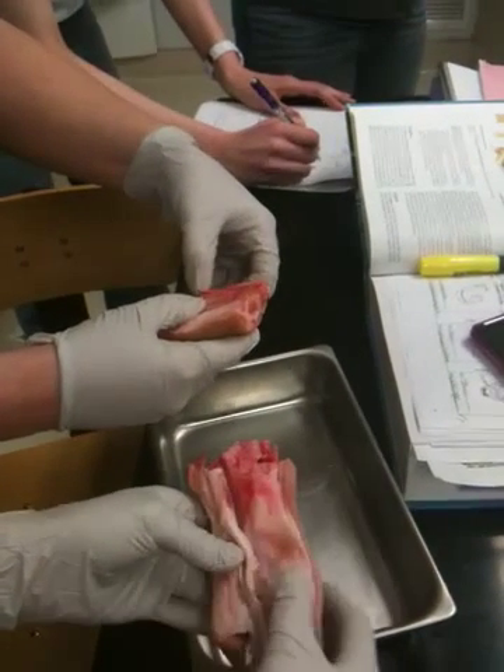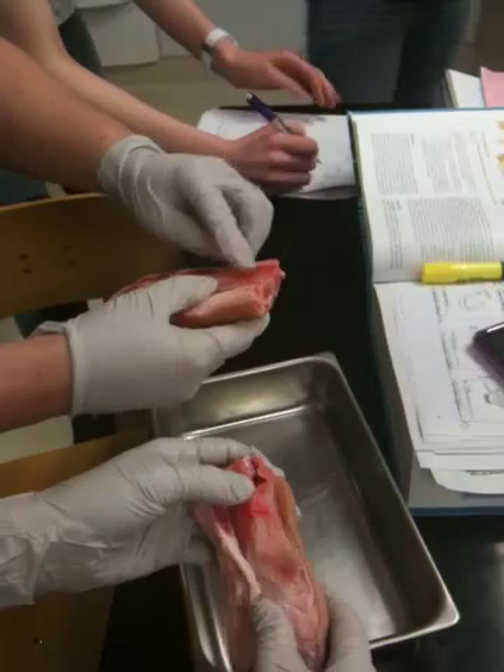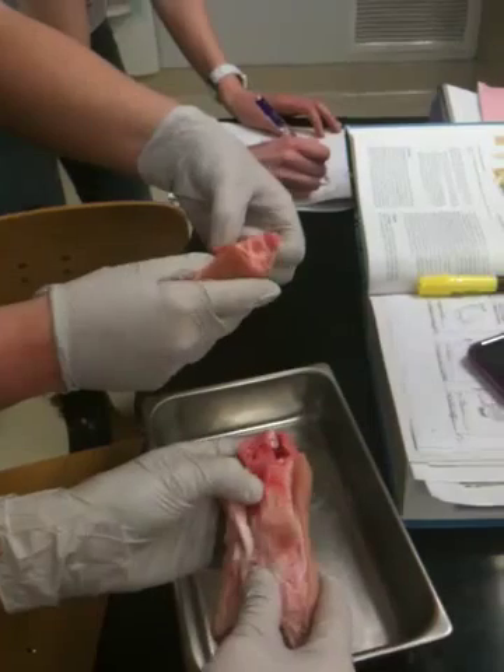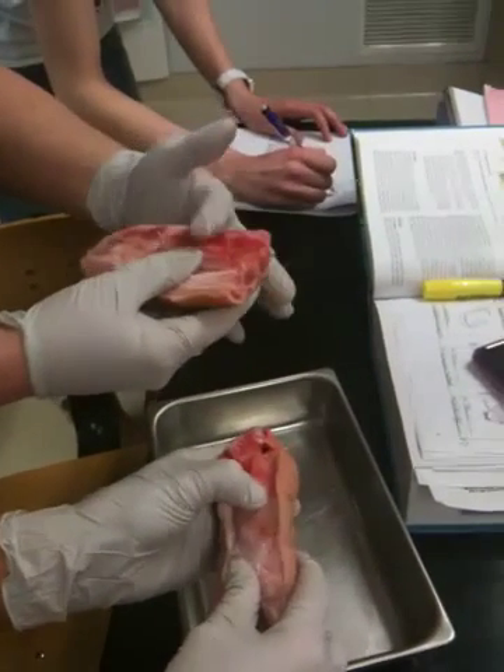And then the medullary cavity — see how that is? Like somebody with the probe messed with it a little bit. That's the medullary cavity in the middle, and that's the fatty bone marrow. That's why it's coming out like that, like margarine, basically.